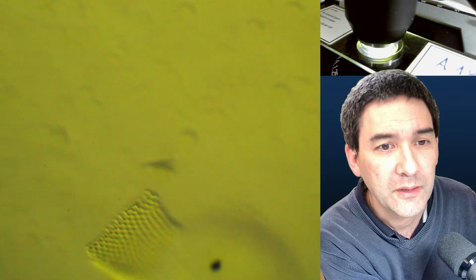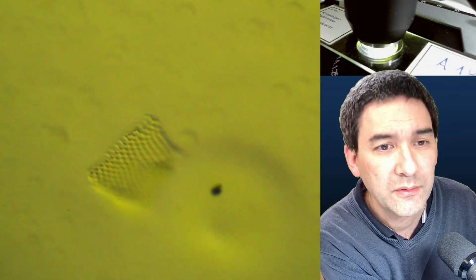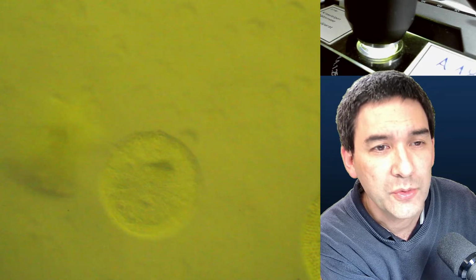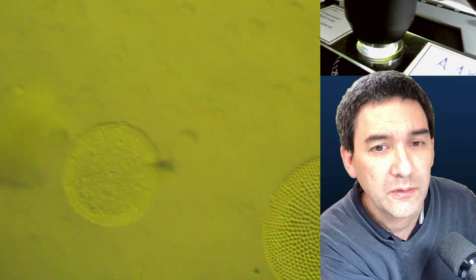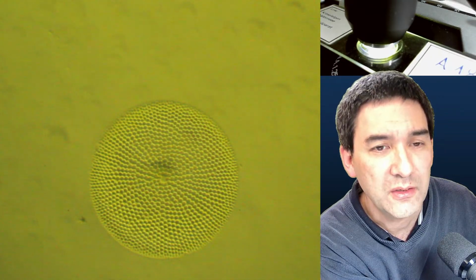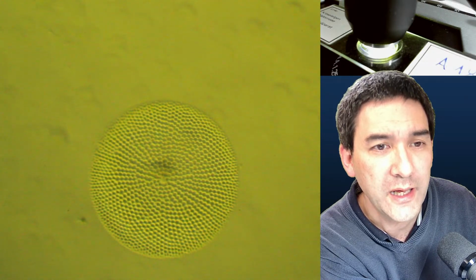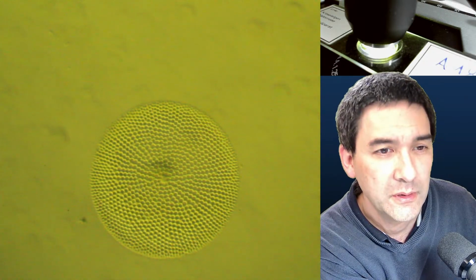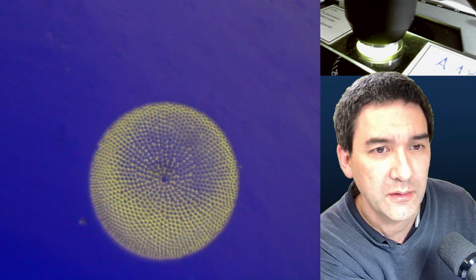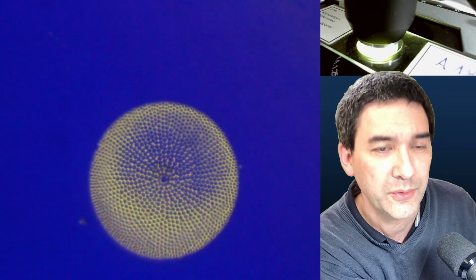So I changed now the magnification. Now the challenge is, of course, again to find an object here. Okay, that's a fragment. Let's try to focus this again. Now I'm using the 40 times objective. Maybe this one over here is better. You do see that there is again a little bit of an oblique effect, because it looks a little bit three-dimensional. But let's move it in here. And then we have it bright yellow on a bluish background.